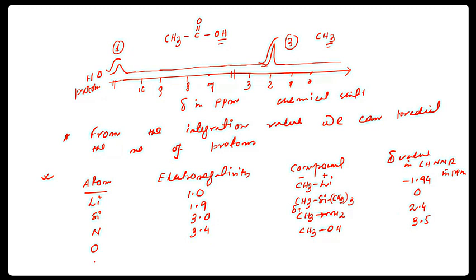Think about fluorine. This is the highest electronegative, 4.0. CH3F. So these values will be highest. This is the highest electron deficient among these three. This is the highest electron deficient methyl, as fluorine is the highest electronegative. This one is the lowest electron deficient, meaning indeed it's electron rich. It's not deficient. So here this proton will appear at the highest ppm value. This is 4.27 ppm.